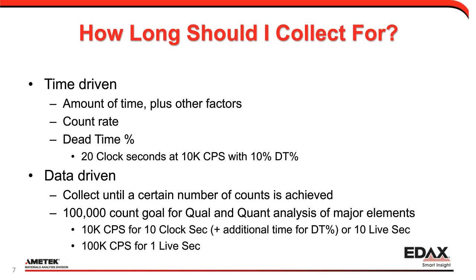When I first started working here at EDAX about 20 years ago, the old rule of thumb was collect for 100 live seconds, and that was a time-driven approach. And that's pretty much the practice that I've stuck to for many years. When we take a time-driven approach, we have to say an amount of collection time. But then we also need to consider other factors, supporting conditions that back up that amount of time.